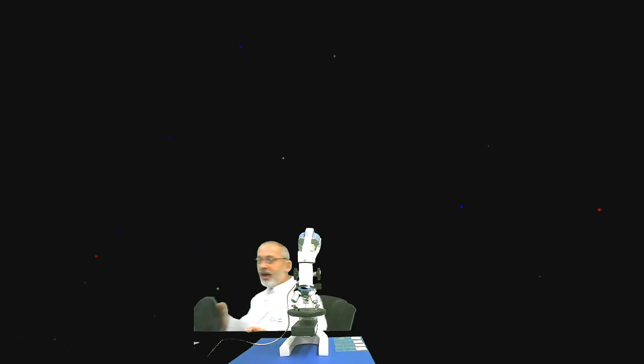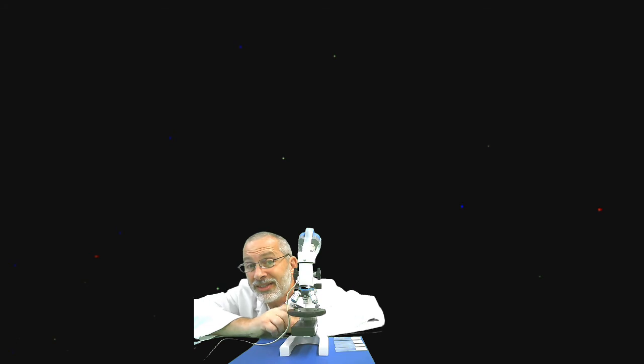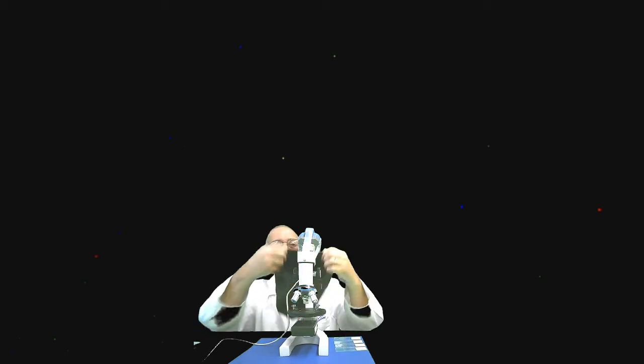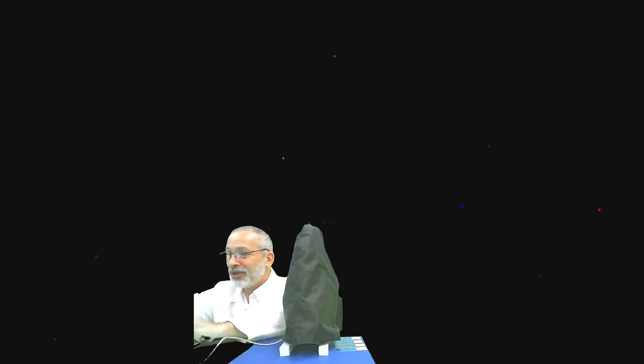And by the way, who can tell me what I have just done to my microscope? What is the acronym for storing it under low objective power before I put it away? Hopefully you remembered SLOP. So I'm slopping away my scope until the next time.